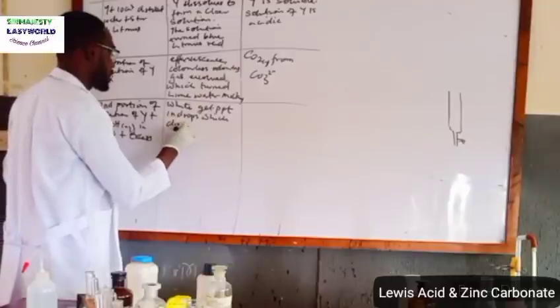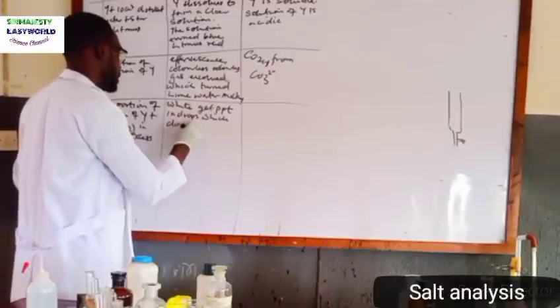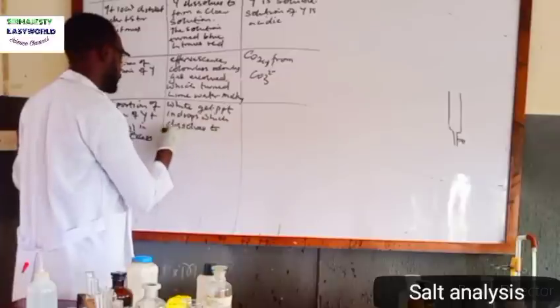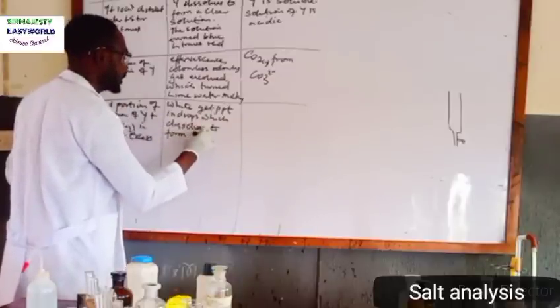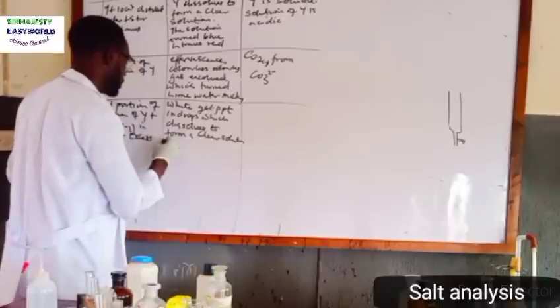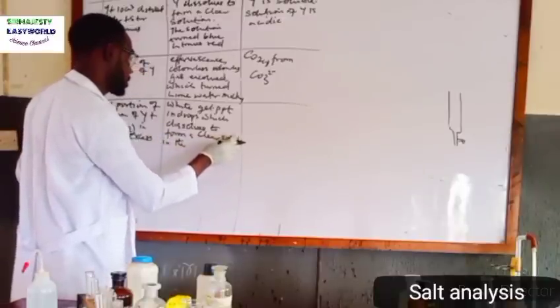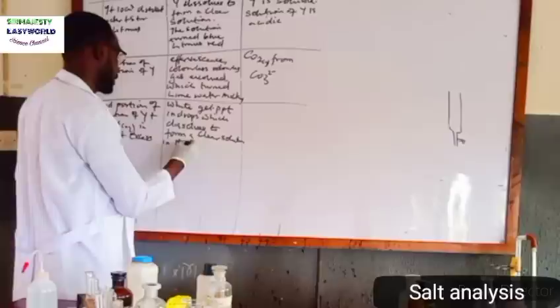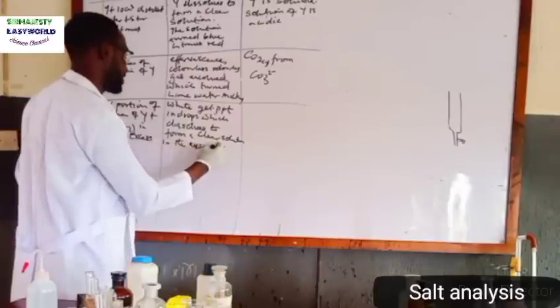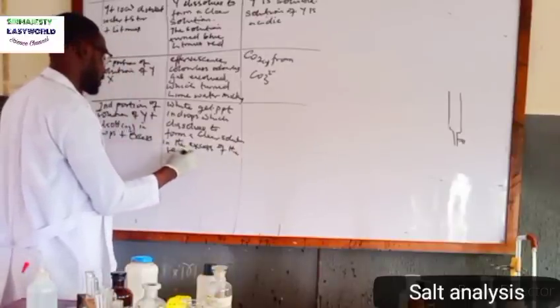What was our observation? We observed white gelatinous precipitate, you can use PPT, in drops, which dissolves to form a clear solution in excess of the reagent, meaning in the excess of sodium hydroxide.